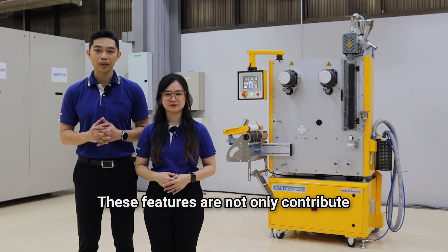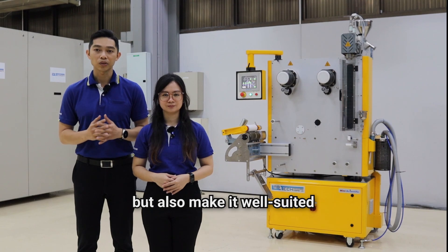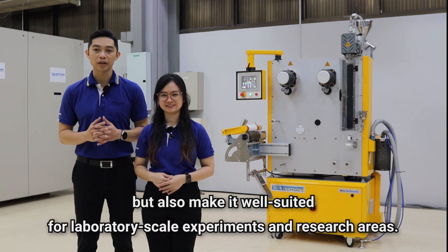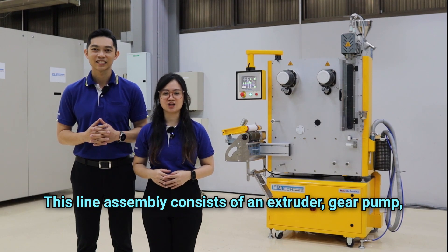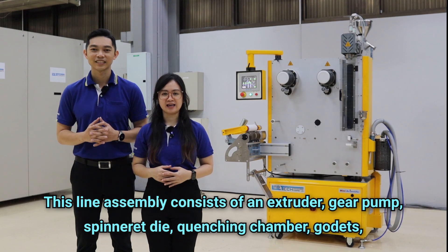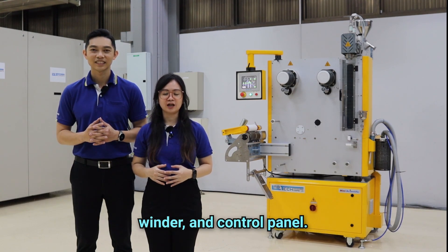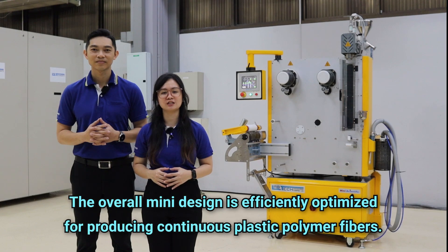These features not only contribute to reduced environmental impacts, but also make it well suited for lab-scale experiments and research areas. This line assembly consists of an extruder, gear pump, spinneret die, quenching chamber, godets, winder, and control panel. The overall mini design is efficiently optimized for producing continuous plastic polymer fibers.